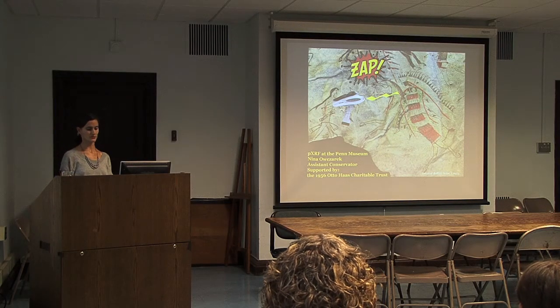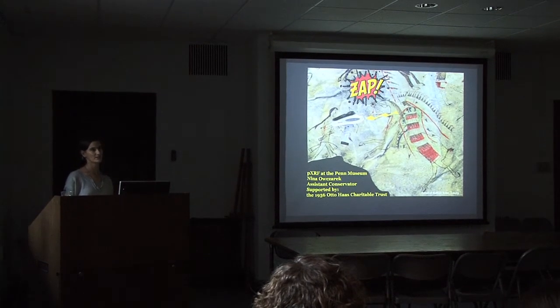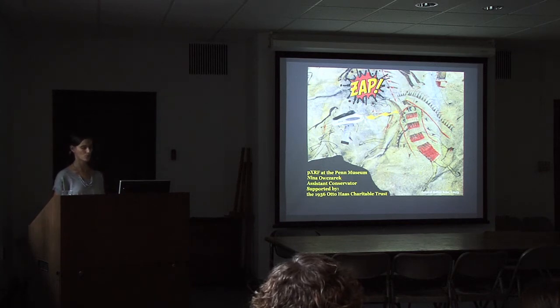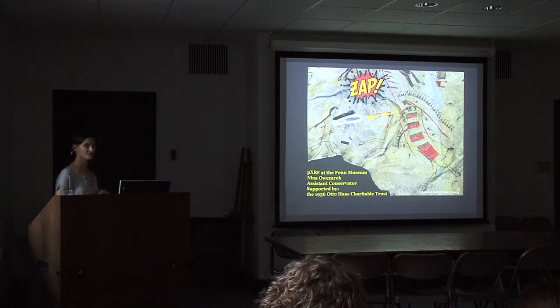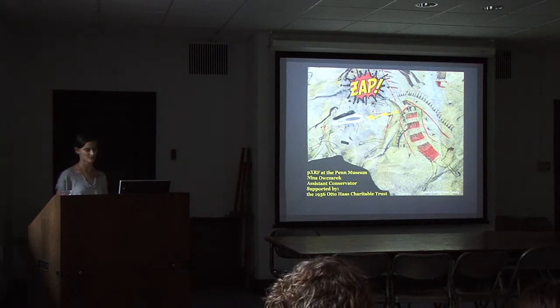The Conservation Department purchased a portable X-ray fluorescence analyzer, courtesy of the 1956 Otto Haas Charitable Trust. Today I will describe what XRF is, how we've started using the technology, and what we hope to develop out of it. The Women's Committee endowment for staff development allowed me to attend a workshop in the spring on XRF. So I started getting my feet wet with this technology, and that's what I plan to share with you today.